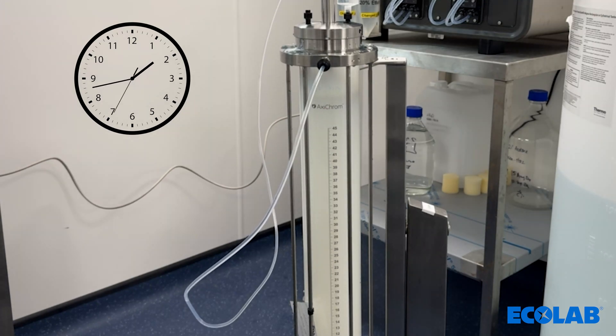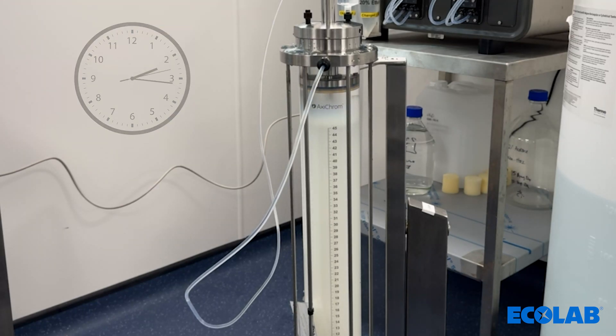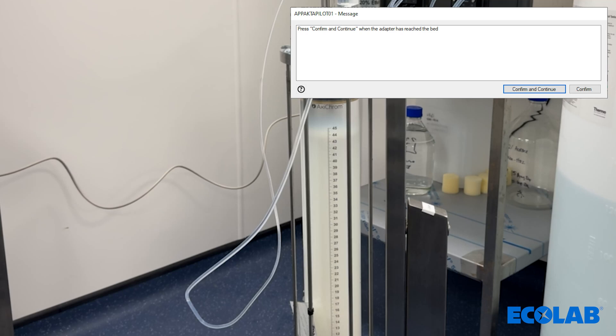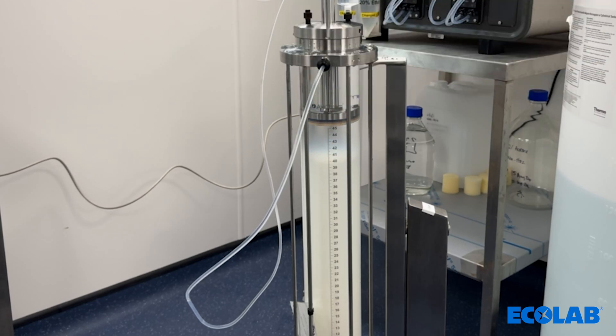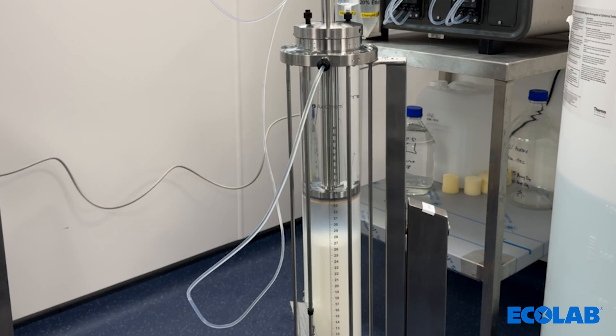As the adapter begins to lower, the bed will consolidate and form a bed. When the adapter hits the bed, you are required to press confirm and continue on the computer unicorn prompt for when the adapter reaches the bed. This step is important as it will ensure the correct packing factor is applied to the resin bed. This then tracks the compression of the bed as this prompt informs the software where a packing factor of 1.0 is and will compress the bed to the set packing factor.